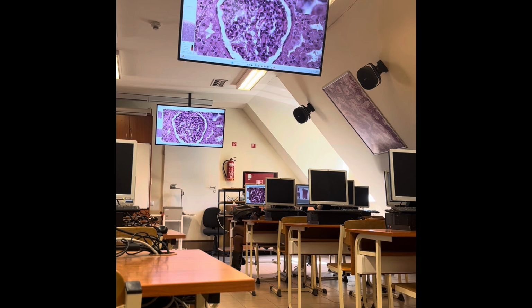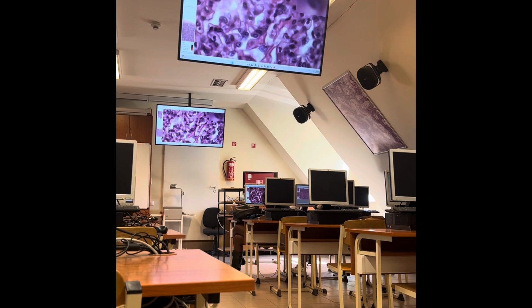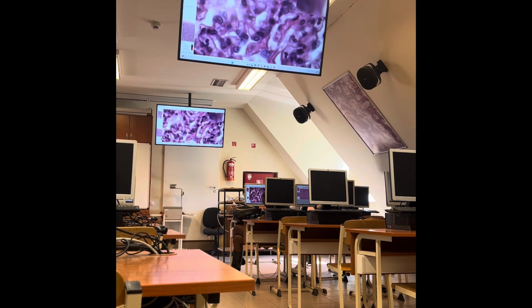Do you remember what are those cells which can serve as supporting cells here? The mesangial cells. Their nucleus is the least obvious. If you find some small oval or round-shaped cell nuclei among the capillary loops, these may belong to the mesangial cells.